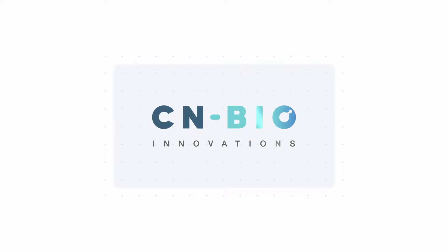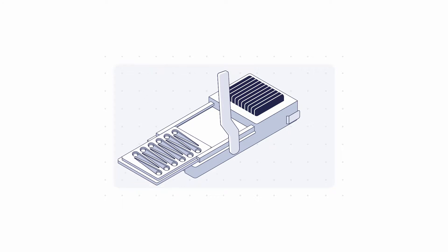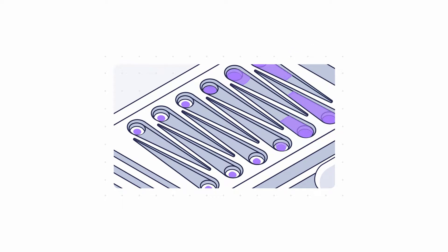To get started with your organ-on-chip cultures, simply dock the MPS multi-well plate onto the device's base unit. Prime the MPS plate with cell culture media and seed with cells.